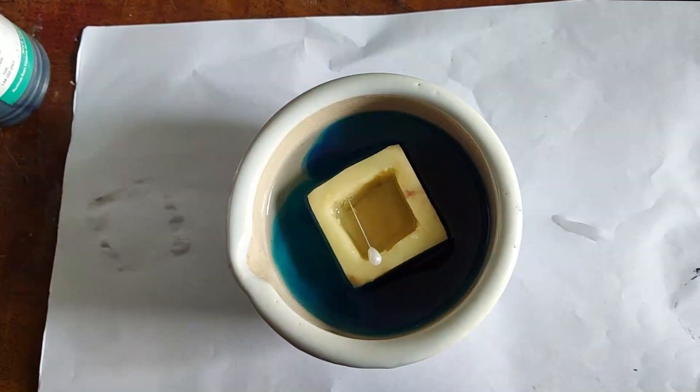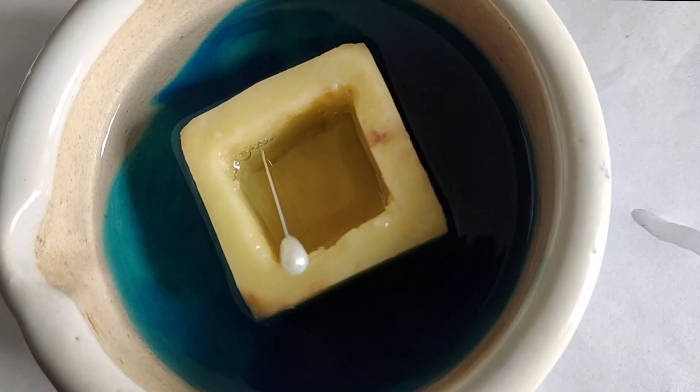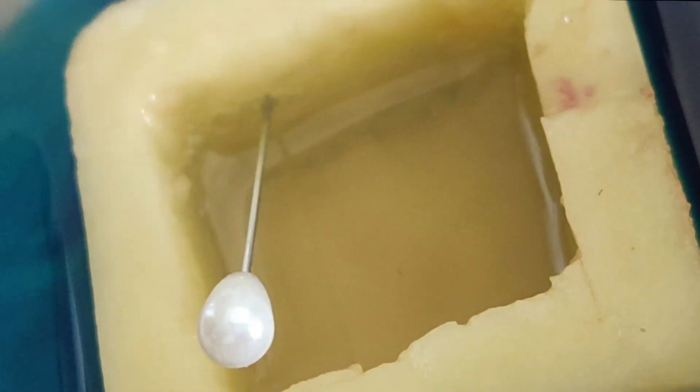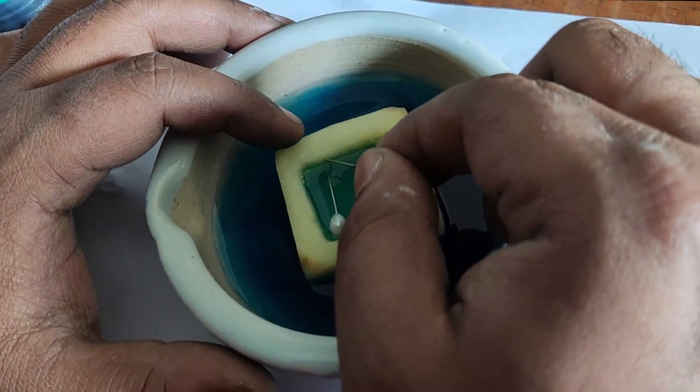After doing so, we will wait for two hours to get our result. Finally, we will take another pin to mark the final water level.